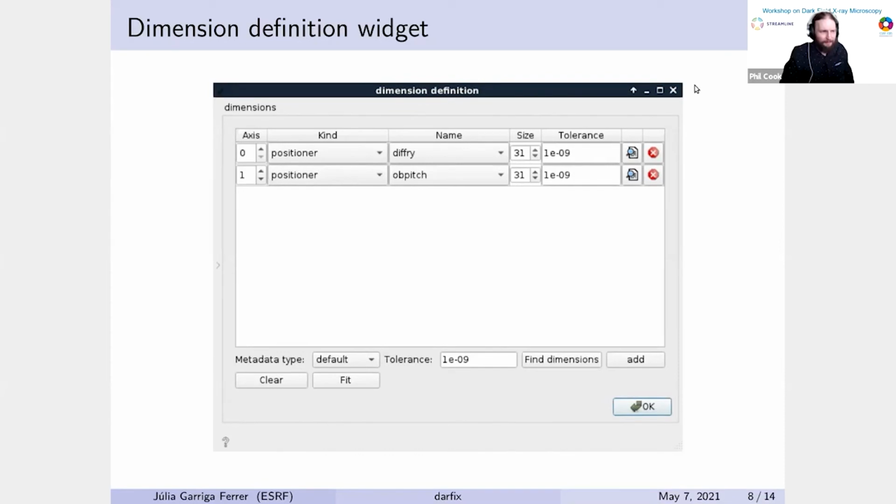Just one comment. You can always use the Python interface directly and not go through the graphical user interface. In that case, you can calculate a pseudo motor as a function of several motor positions and use that as a plot coordinate instead of, as is proposed in the graphical user interface, a real hardware motor. Another possibility would be to calculate that pseudo motor position directly in the data acquisition and store it in the list of motors, and then you have direct access to that, but that's not implemented yet either.